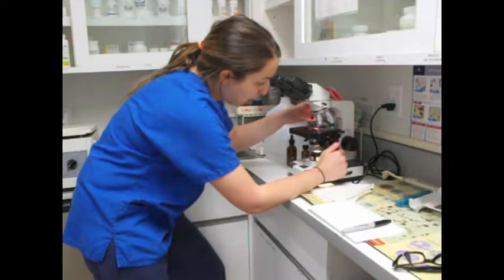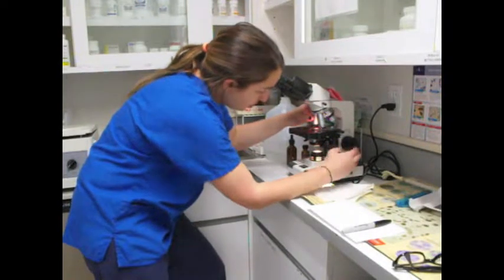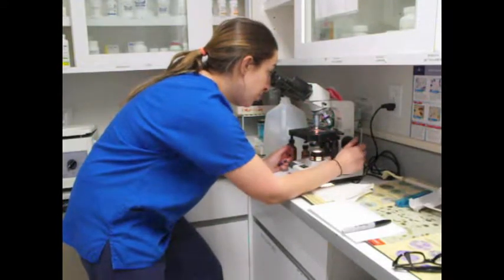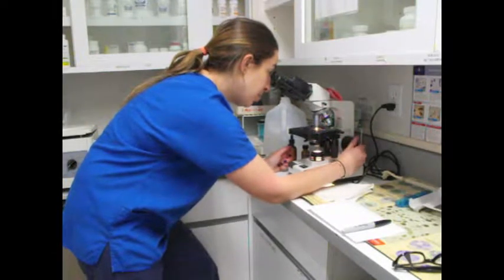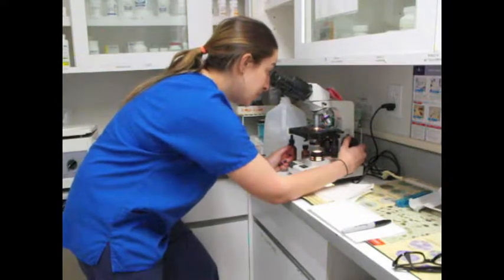This is the high-dry power lens. It's right here. Again, you want to refocus the microscope. I'm going to make sure it's in focus for you to be able to see.